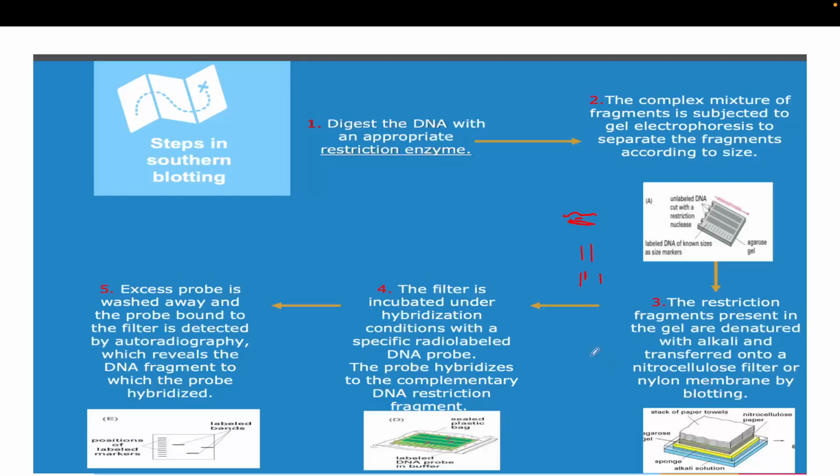There is a sandwich type of blotting setup. In the lower part there will be the negative charge, because your DNA has a negative charge, and it has to move from negative to positive, right? So there is a gel, and above this gel there should be the blotting membrane, and to make the packaging very tight, you have to add additional sheets on the upper side as well as the lower side of this gel. Then the apparatus will be very tight and there will be no air gaps.